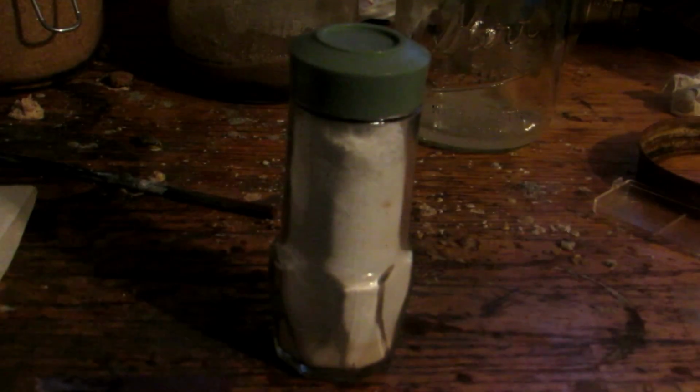Okay, so after that, I simply just filtered it off and dried it in the oven. And upon drying it in the oven, I just crumbled it into a fine powder. And you can see that we're left here with this nice fine powder of silicon dioxide. So you can see it's extremely white and very pure. I weighed this, and this is exactly 20 grams of silicon dioxide, which means that we got about 20% of our original 100 grams of sand converted to silicon dioxide.